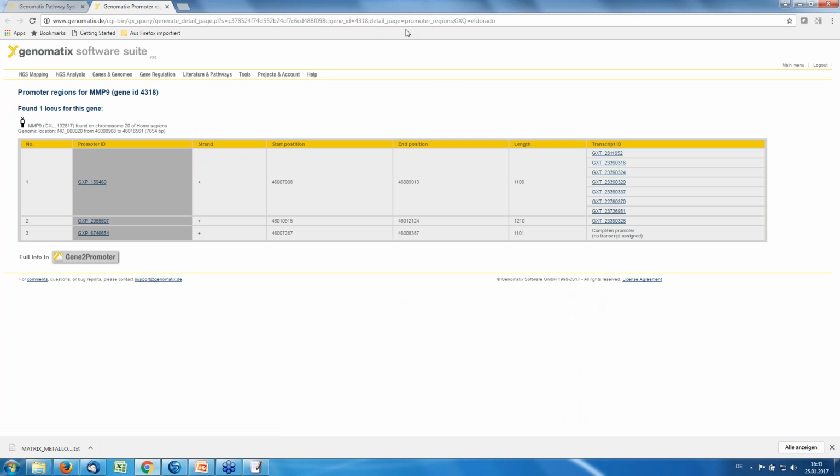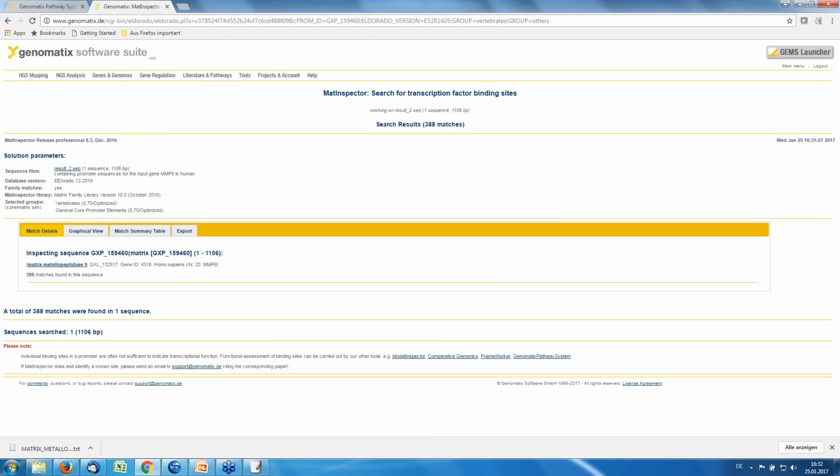If you click here, this will open a new page. We have a list of the promoters here with promoter IDs within our database. The first promoter here is probably the main promoter of MMP9. It controls a large number of transcripts. And we can do a quick analysis of the promoter just by clicking on the link that we have here.